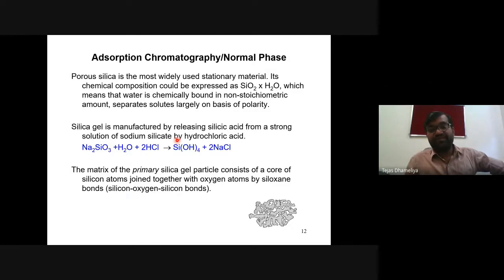Depending upon the nature, these kinds of silica gels are also modified. You must have heard the name silica gel G. What does that G stand for? G stands for gypsum, which in Gujarati we call chirodi. That gypsum is a kind of binder used in such silica, so that is silica gel G. Silica can also be modified depending upon need, whether we make it fluorescent or non-fluorescent. There is another type of silica called silica gel GF, and it has many types, 254 and many others.